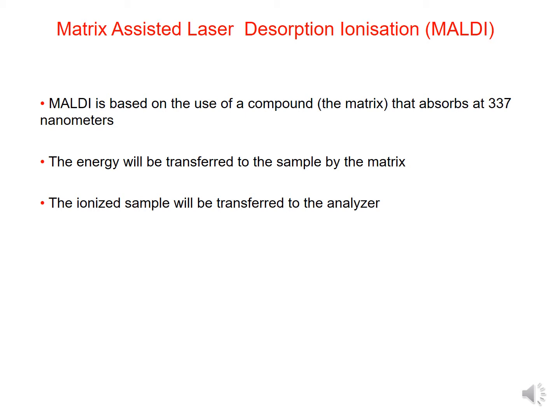The MALDI is based on the use of a compound, which is named the matrix, that absorbs at the wavelength of a laser. The wavelength is classically 337 nanometers. Then you have a compound which has the property to absorb this wavelength.